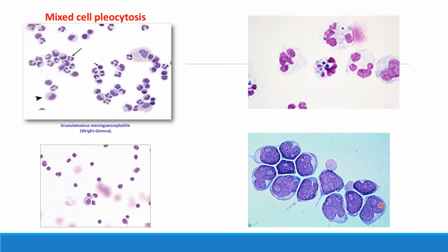They have enormous nucleoli. They have exaggerated, normally in a monocyte we like to just see a dent. These are exaggerated. This is beyond a dent, right? And the chromatin doesn't have a tight, even feel to it. It's kind of more lacy, which they call dispersed. Okay.